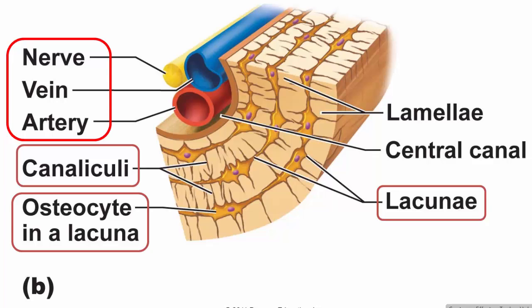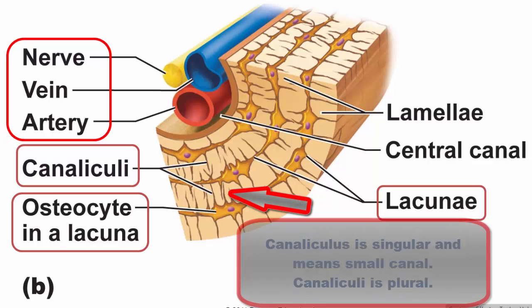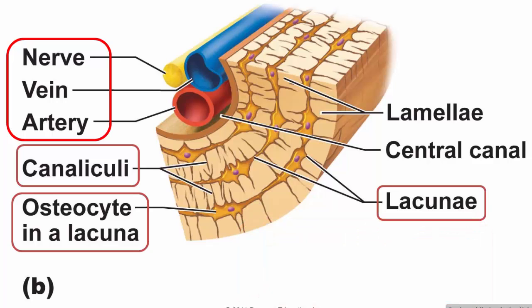Now these osteocytes are trapped inside the lacunae, so they are no longer able to go anywhere, and they do not secrete a lot of matrix. And in between these lacunae, there are connections. These are called canaliculi. So every one of these lacunae has a canaliculus that connects lacunae together. And what is the value of having these connections? Well, these cells are far away from blood. They cannot get any diffusion from blood because the bone is calcified. This is basically impermeable to any diffusion.